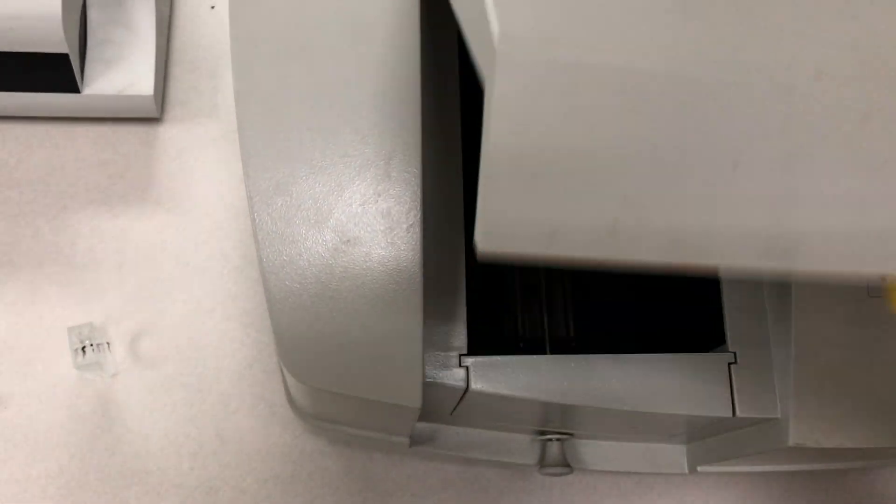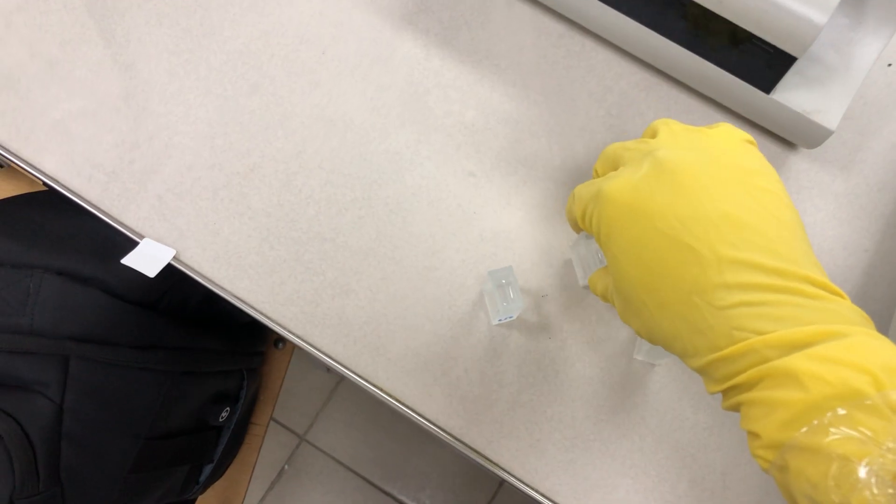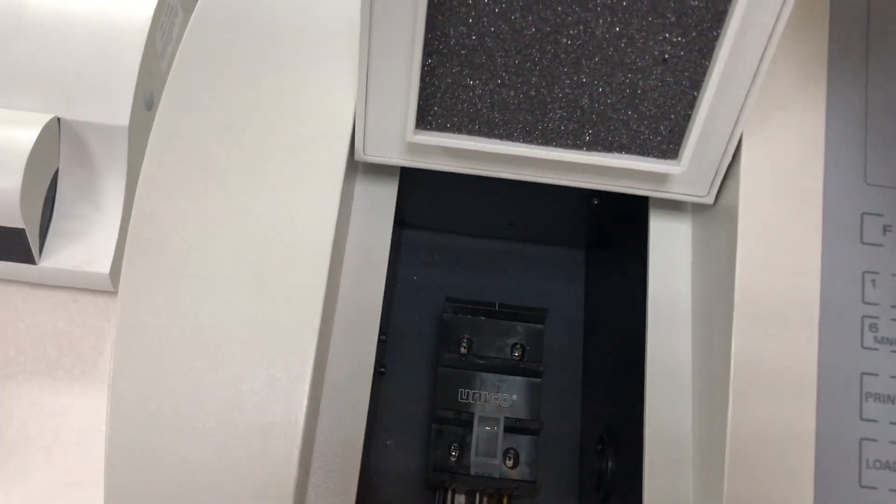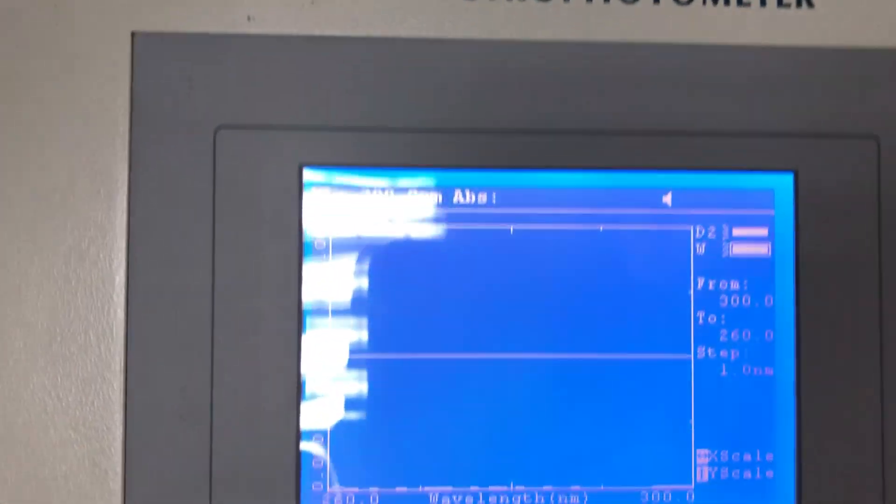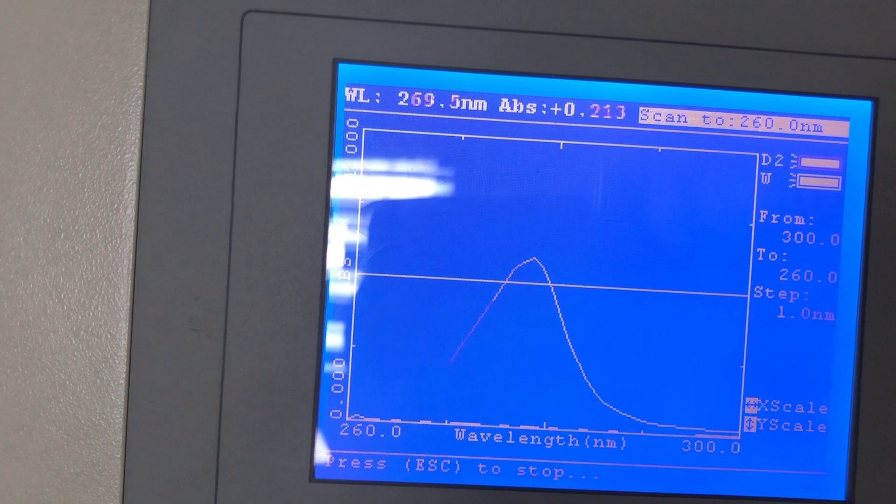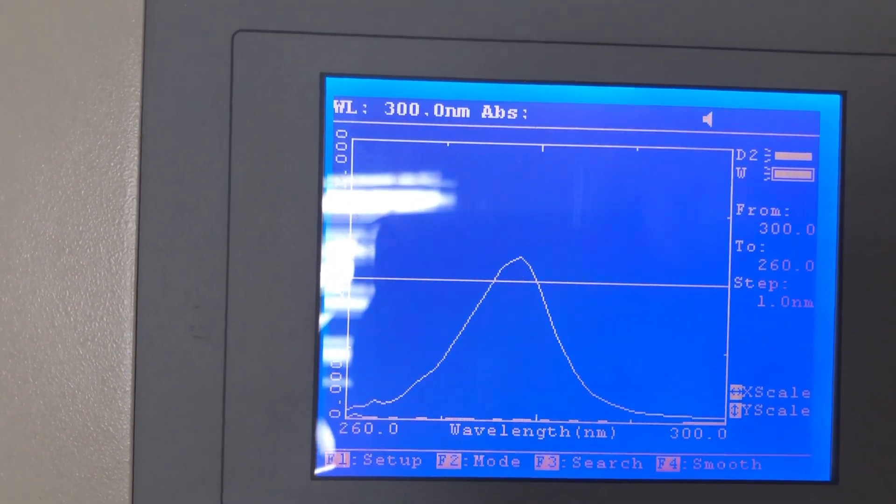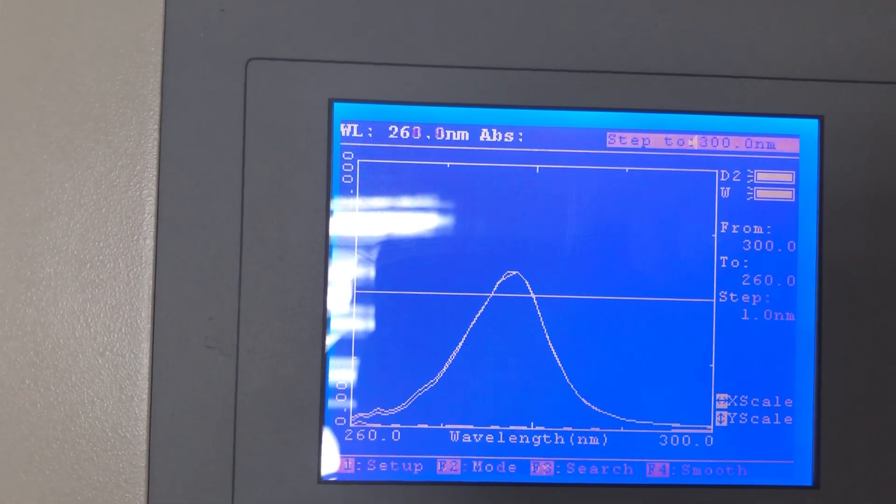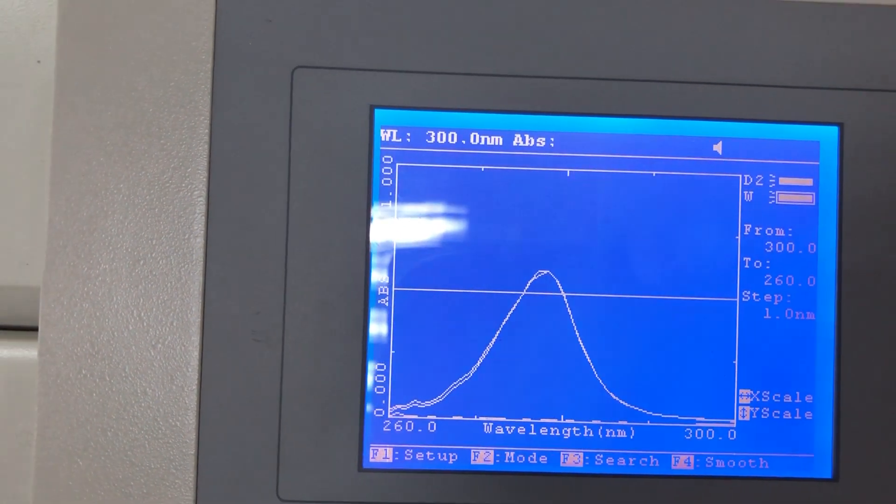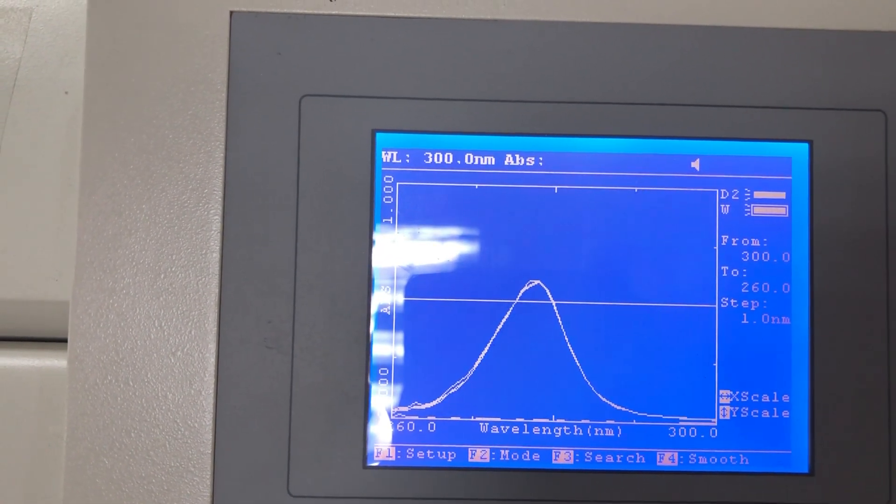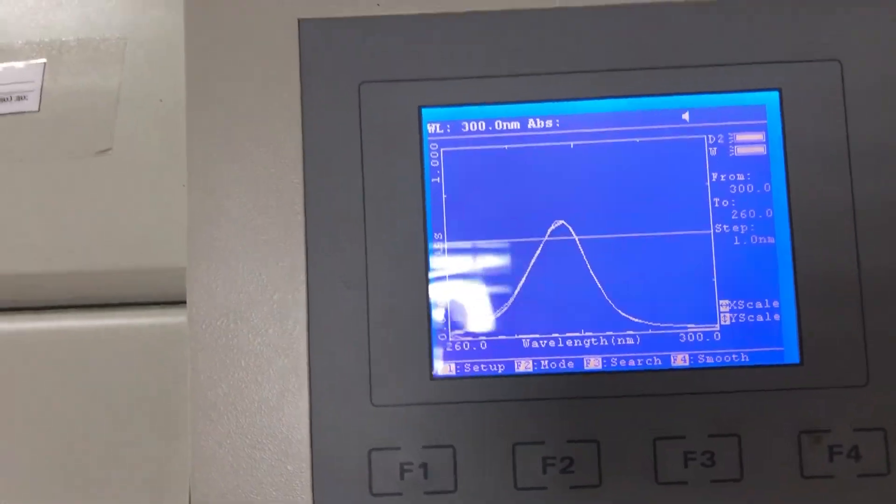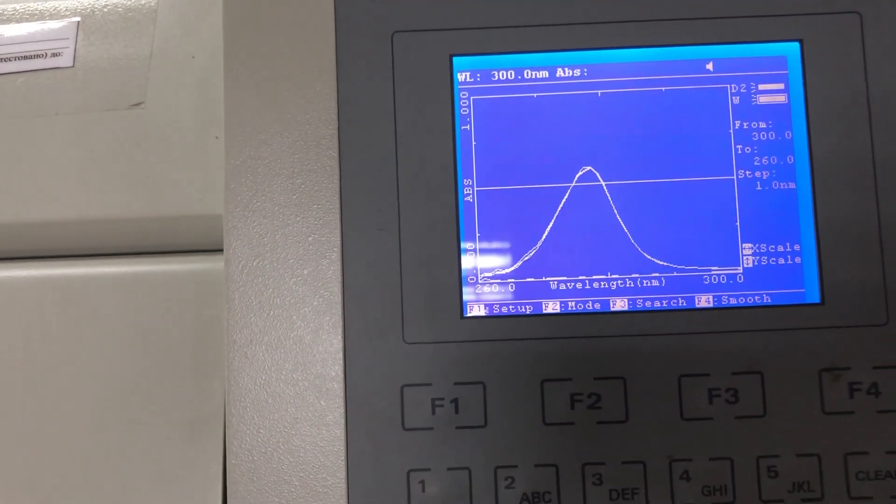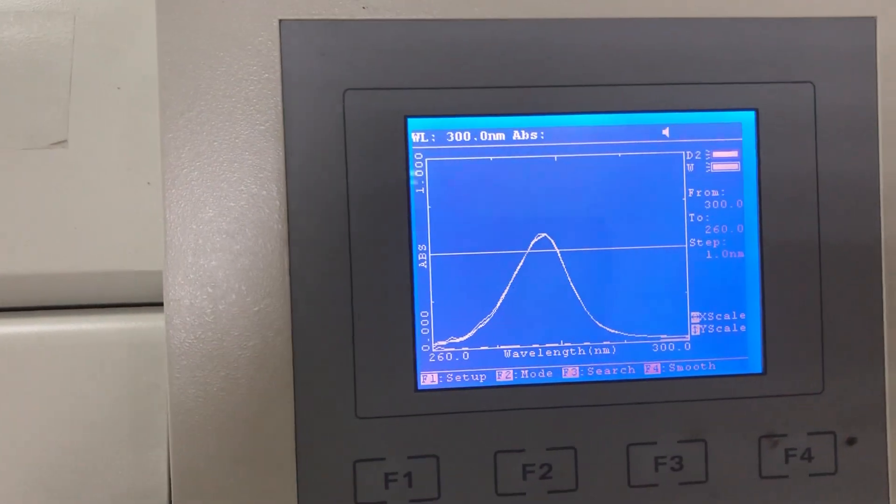Now open the lid and change for the sample. Make sure to put it here like this, close it, and press start and watch the curve. After scanning, we will hear beep sound three times.